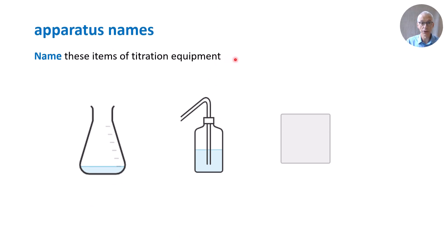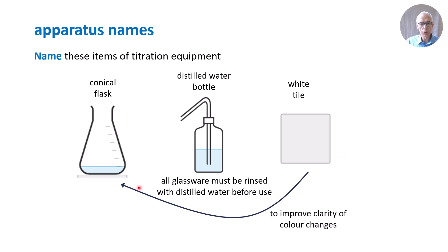Here are three further items of titration equipment. Can you name them? Conical flask, this is a distilled water bottle or wash bottle. Please note, all glassware must be rinsed with distilled water before use. This is a white tile. The purpose of a white tile is to place it underneath the conical flask to improve the clarity of color changes.